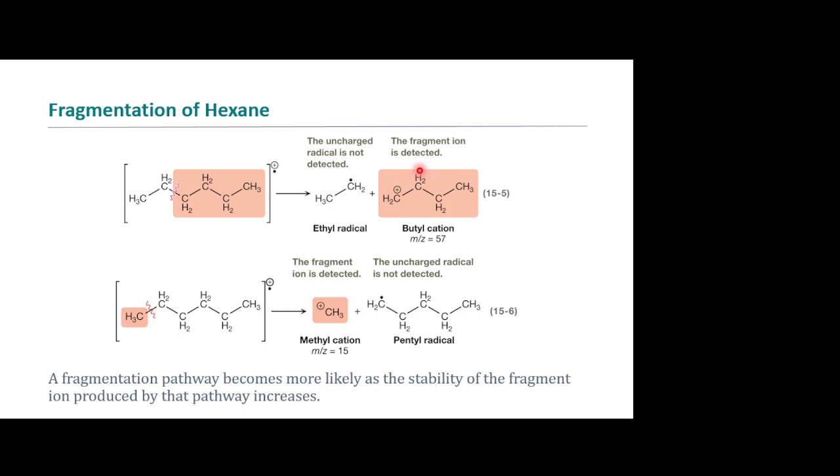Yeah. Okay. So then the other ones are just where it's cut at a different point. Exactly. Yeah, and by notation we just leave the positive charge at the cut point. Very likely, it's not actually that location where it stays. It very likely rearranges onto these. But it doesn't actually matter. They have the exact same charge to mass ratios. The hydride shifts are fast enough that you should probably be able to see them.